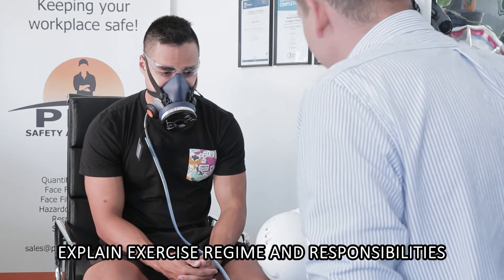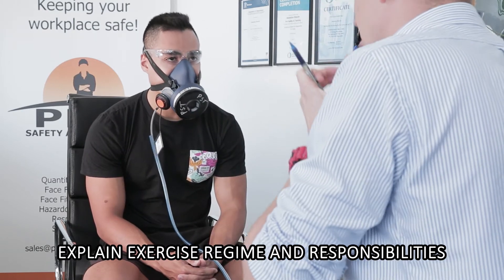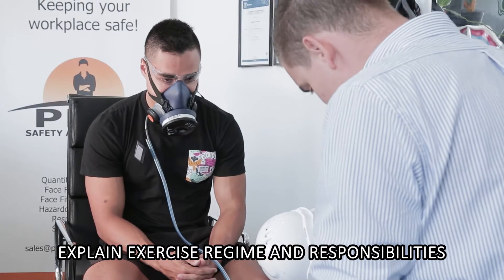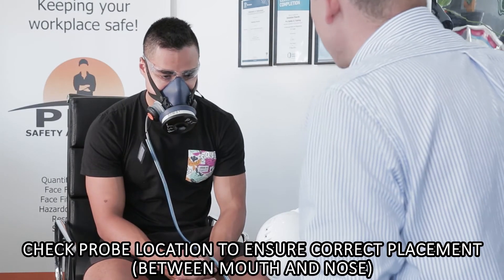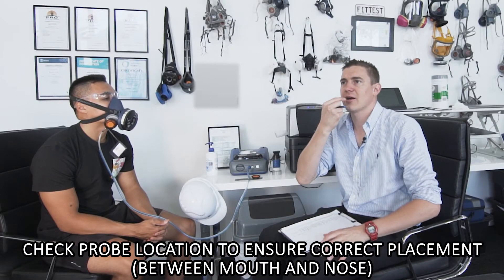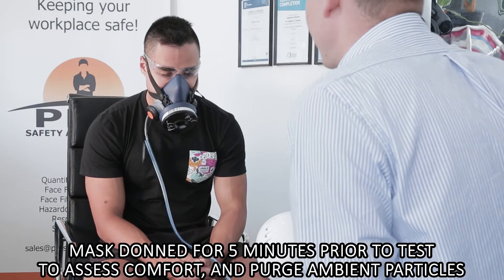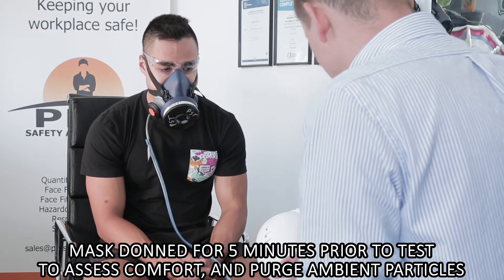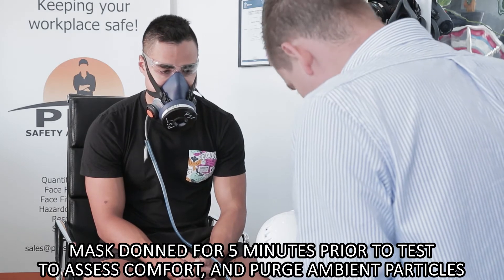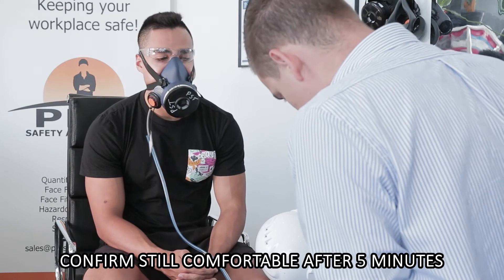Your main responsibility is to stay where you are — don't go walking away too far because you'll pull the port-a-count off the table. Don't go touching the mask, don't go adjusting it. Just leave the mask on just as you would in the workplace. Probe location is suitable — the probe is installed between the mouth and the nose, so it's in the perfect location. James, you've got to have the mask on for five minutes before we test. We've gone through this protocol and we still have a fair bit to go, but by the time we start the test you'll have it on for well and truly five minutes. I'm going to confirm — is it still comfortable? Excellent.